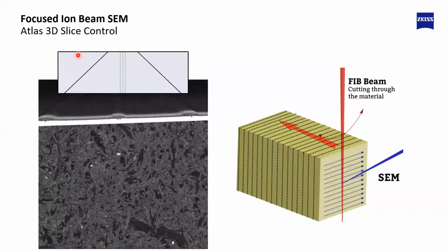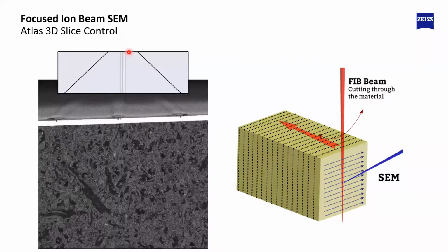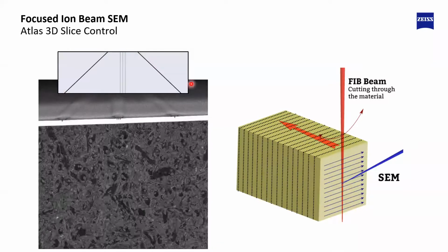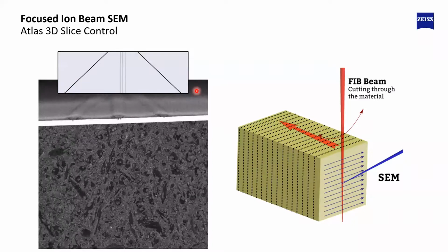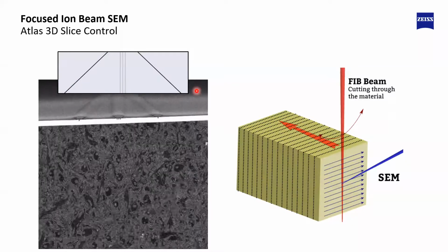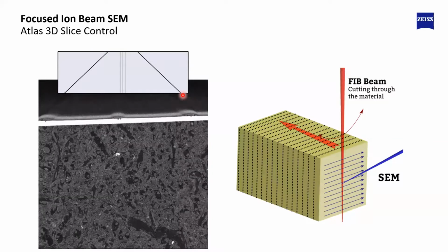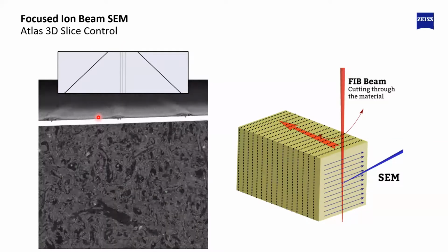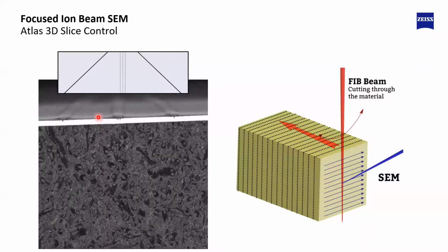While we are moving in here, again, that direction would be up in this image, those trenches on the side will come closer together. And we can measure how far they progressed and closed in. And by also knowing the angle between those two trenches, we can very easily calculate how much ablation progress we actually did in the last ablation.